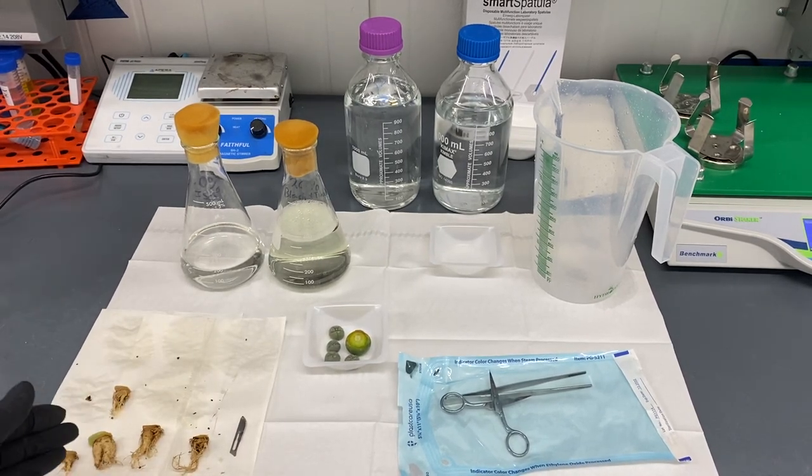All of the roots - I'm going to let that callus over on the top, replant those, and hope for some great propagation.